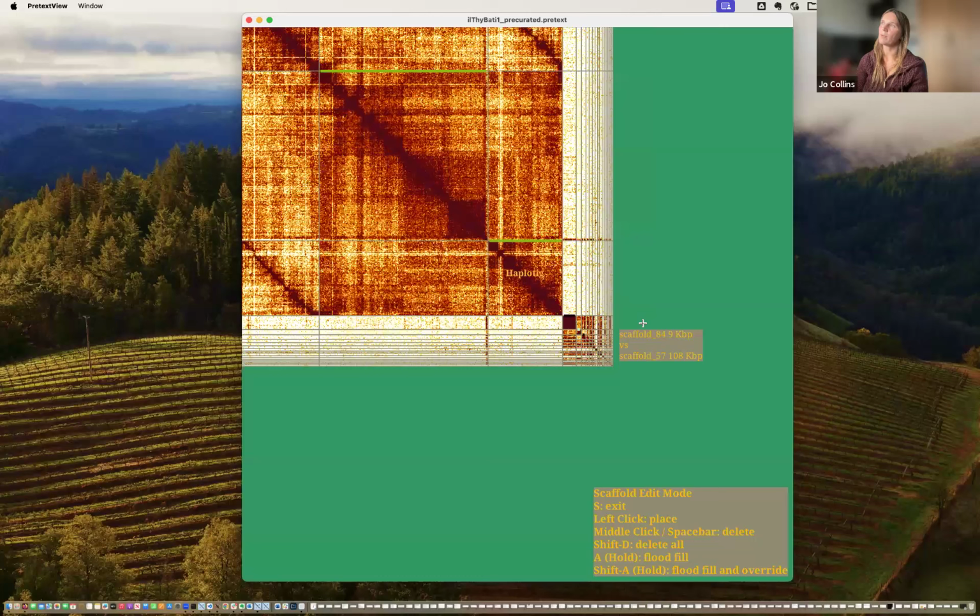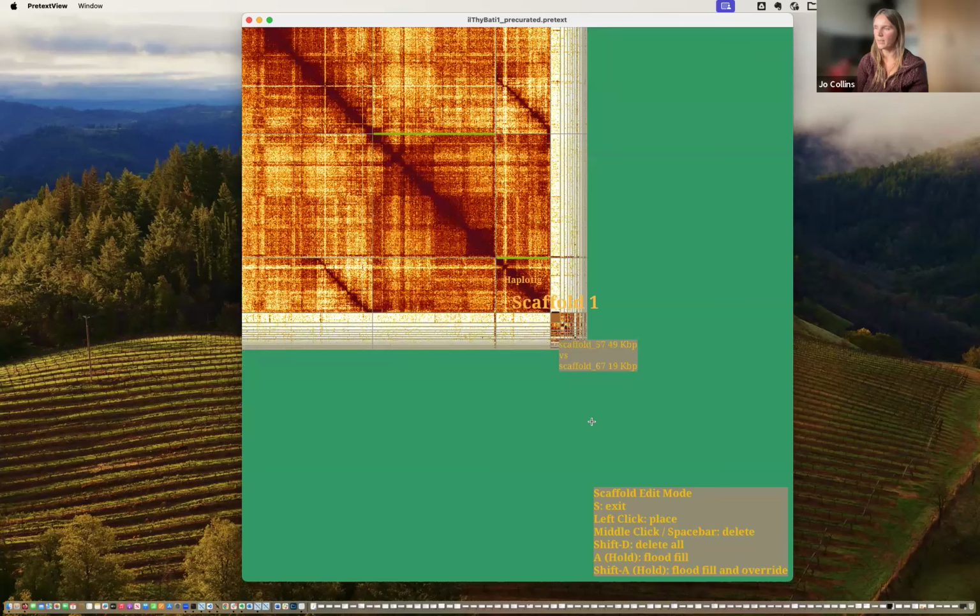Basically that means rather than trying to pick up all the tiny pieces to paint yourself, you can use this flood fill tool that it has in order to make that easier for you. So how I always start this is I click on a piece of shrapnel that I'm not going to include.